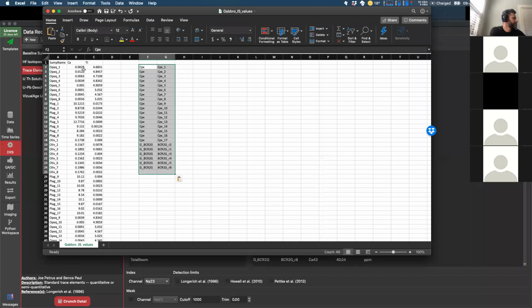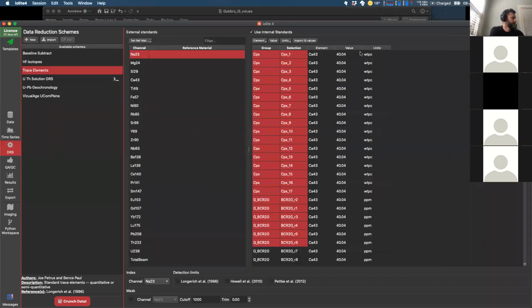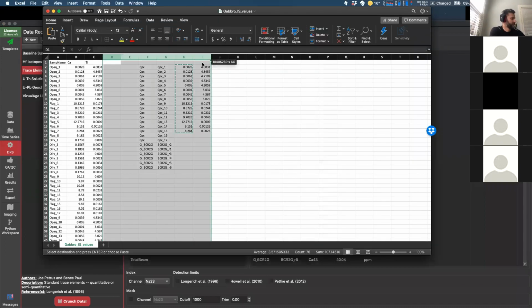And then I could actually take my probe values, line them up, and then paste those in. So, you know, I could then copy these and paste them in here. But they're not correct values. I'm just demonstrating here. So I'm actually going to select those out.